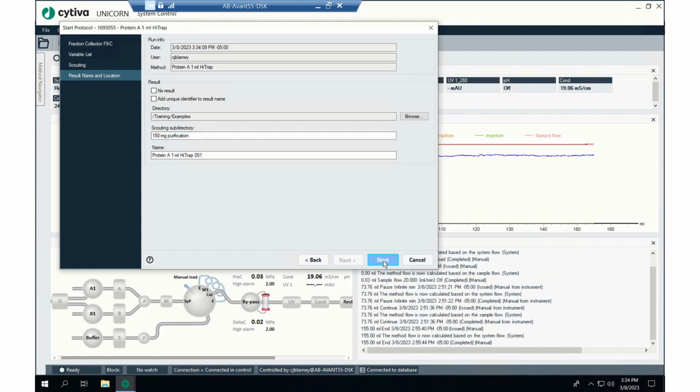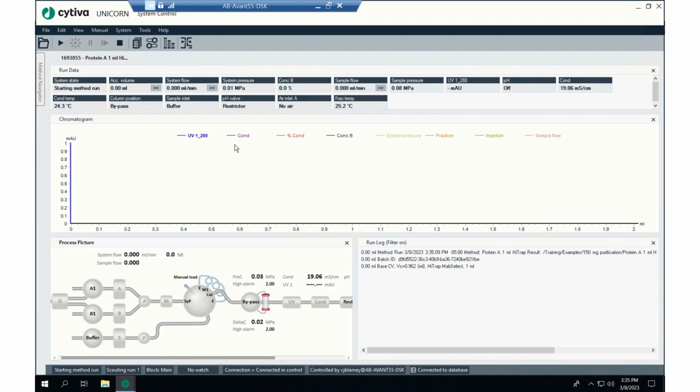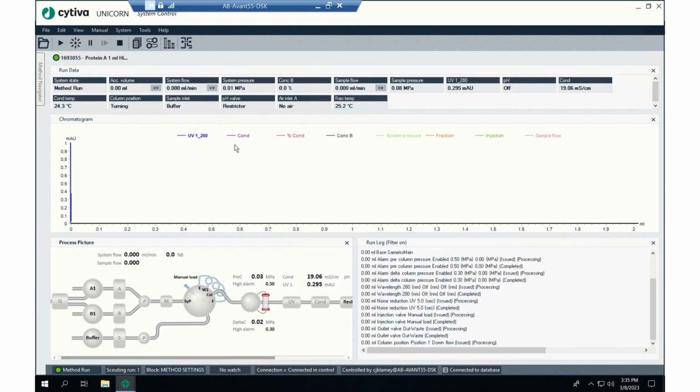Start. All right, so now for column tracking, you can see where this would be really important, because now we have 15 runs here, all the way down. But again, we're not tracking this column, so we're going to disable this. That only disables the first run, so we want to apply this to all the methods that are being run. So we'll hit OK now that it's disabled, and that's it. The run started.